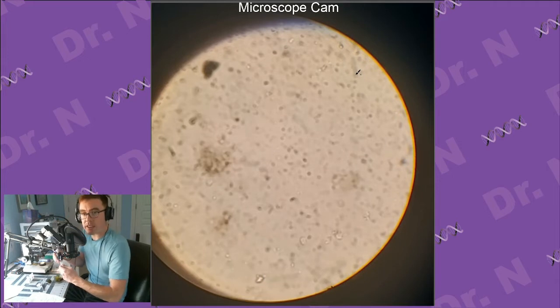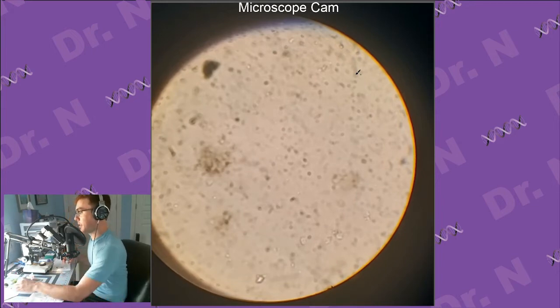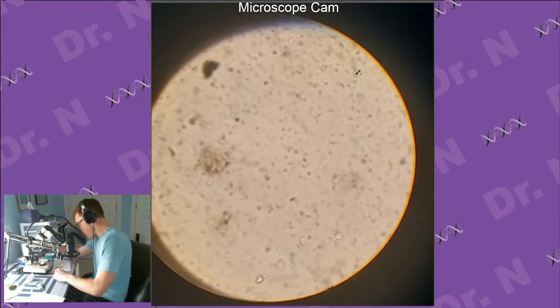All right, so this is turning out to be a different color. It's probably just from the soil. And at least in this area, the color of a lot of the soil comes from the tannins released by the decaying plant matter. So we'll see what this looks like.